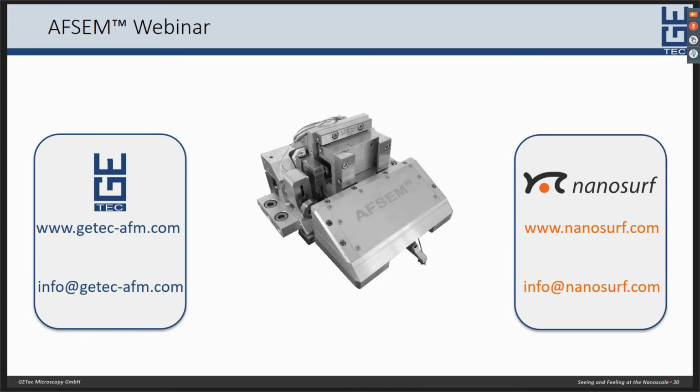One question that was posted is, does the geometry of the AFSEM allow EBSD measurements? EBSD is usually done at a huge tilting angle, for example at 70 degrees. But depending on the SEM, we can insert the AFSEM in a way that it just tilts with your stage, and you can retract the scanner during the EBSD measurement so that it does not get in any conflict with the electron pole piece of your SEM.